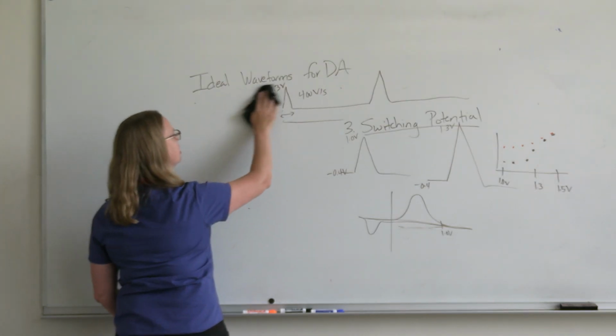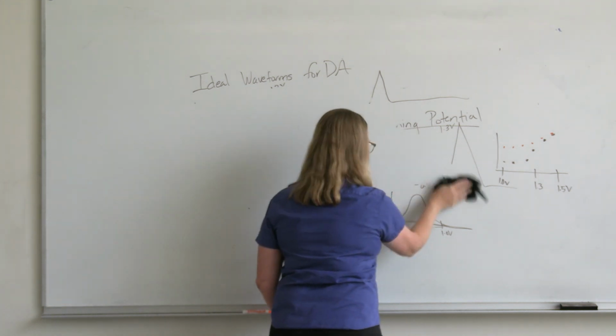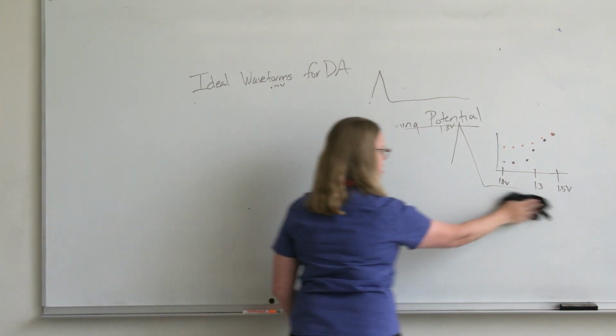All right, last thing on the ideal waveform is scan rate.